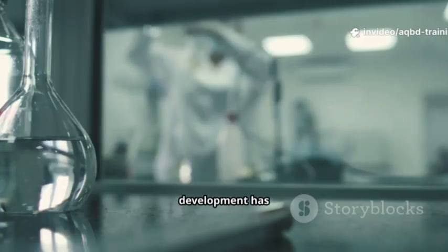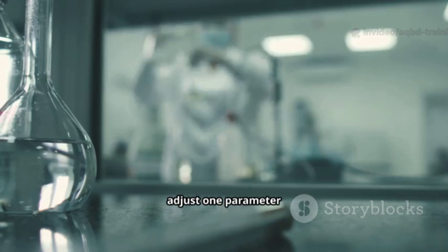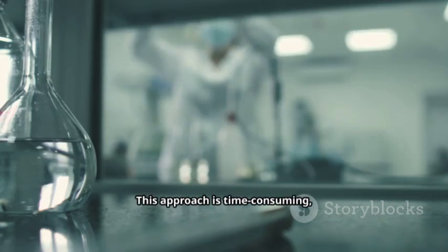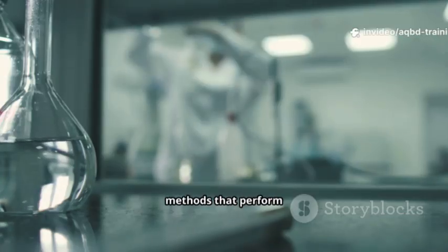Traditional analytical method development has often been a trial-and-error process. Scientists would adjust one parameter at a time, hoping to achieve acceptable results. This approach is time-consuming, resource-intensive, and often fails to provide robust methods that perform consistently across different conditions.